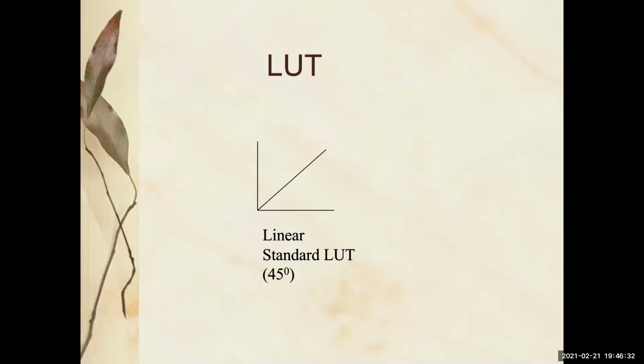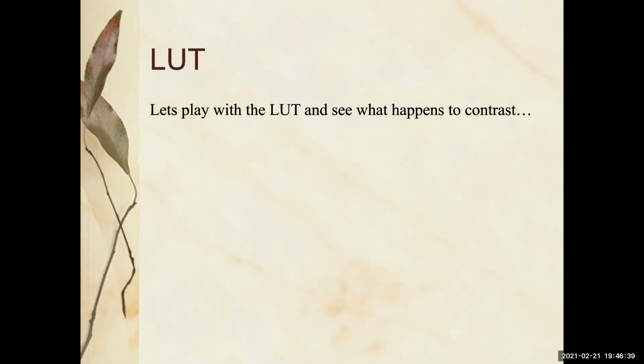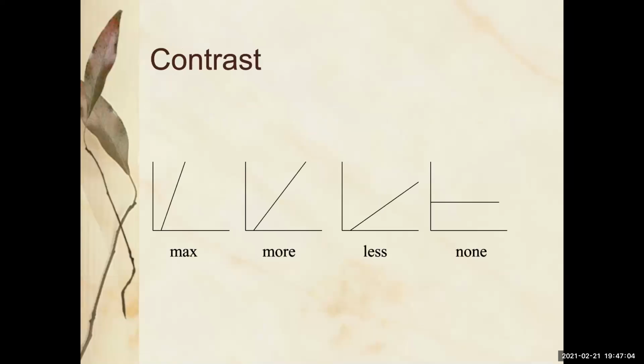I was like, why wouldn't you just show an image like the image is? Well, nothing is really shown as the image is. Everything needs to be decided upon and shown. Every time you take a digital image and show it on a screen somewhere, something is being decided about it and probably changed. So let's play with the lookup table. Now we know the lookup table exists and is at the heart of displaying your images. Let's take that lookup table and play with it.